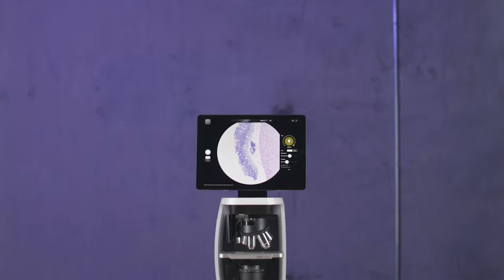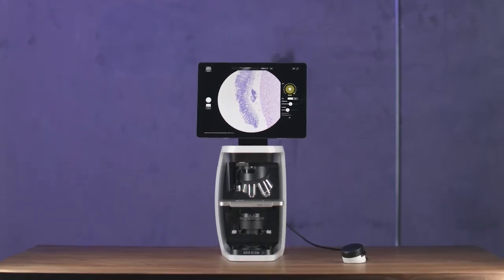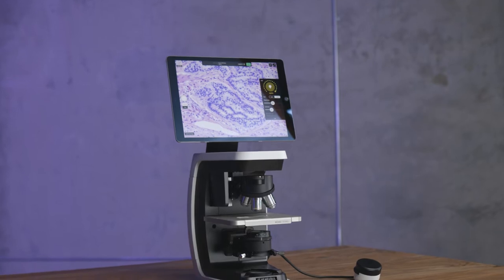Meet our newest microscope, REBEL. REBEL was built around a singular vision to rethink traditional microscope design.